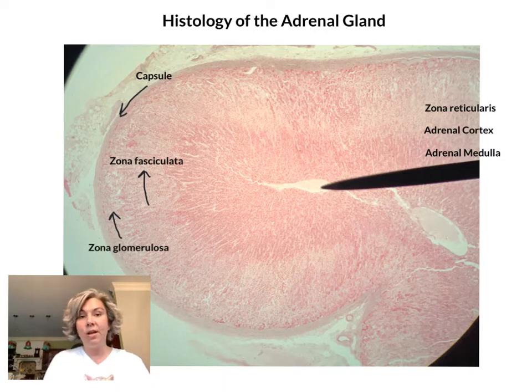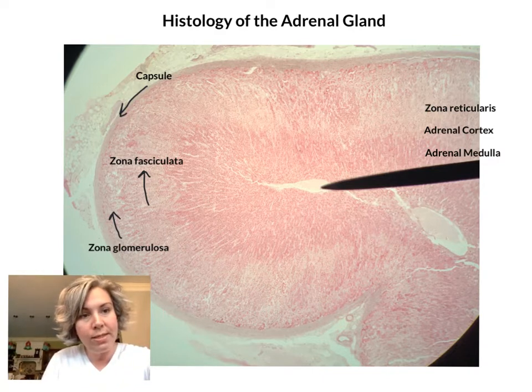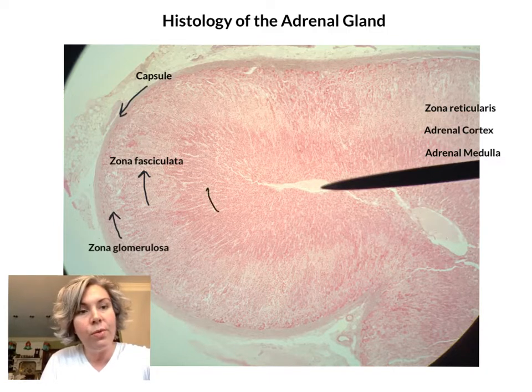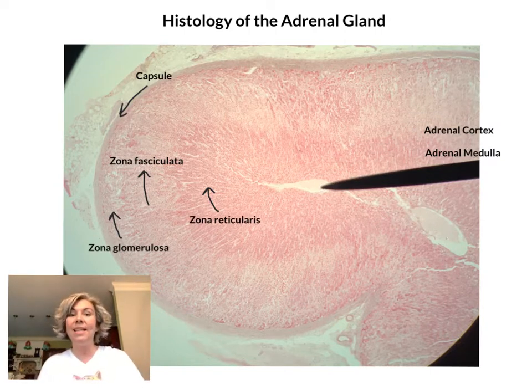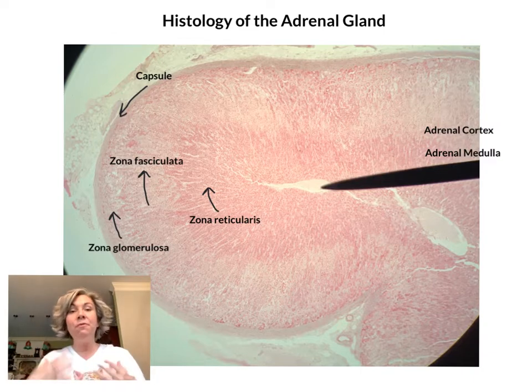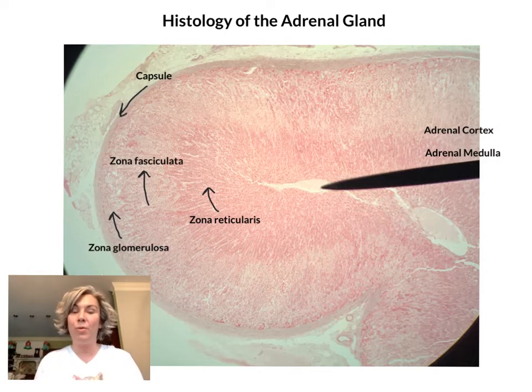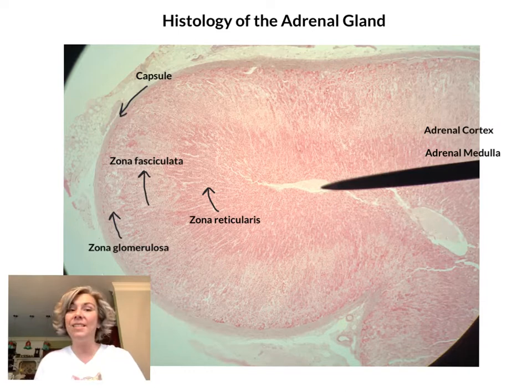Just below the zona fasciculata is the zona reticularis. We can see the cells start to get a little bit darker as we go deeper. The zona reticularis secretes a hormone called DHEA, and it's an androgen — meaning it's a male hormone. Both males and females secrete DHEA, and some of that hormone is converted into estrogen in both males and females. So females have male and female hormones and males have male and female hormones — we have a little bit of both regardless of gender. The zona reticularis helps to secrete and supplement sex hormones that play a role in various activities in the body.